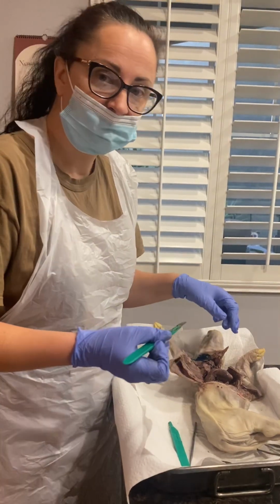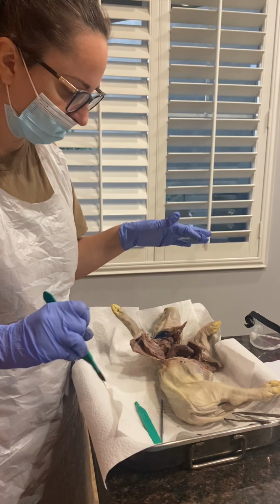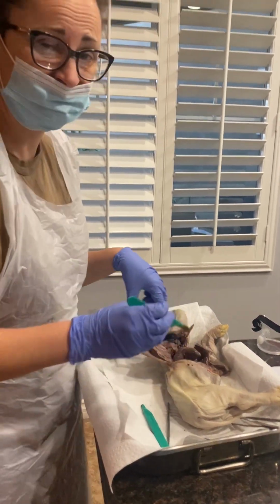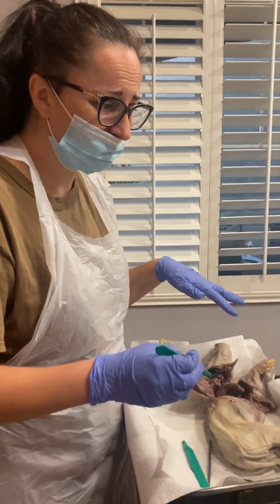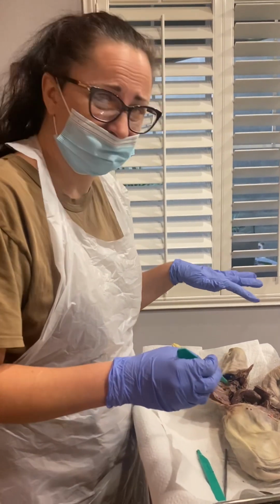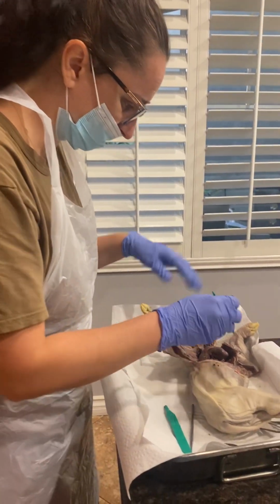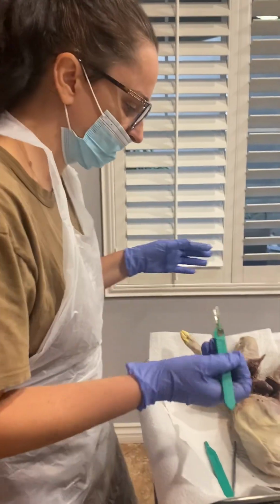Okay. Hi, this is Dorothy, and today we're going to be going over some parts of the pig. I named him Billy, and he's all chopped up. I kind of chopped him a little bit too much 2 weeks ago. I kind of destroyed his thyroid gland, and I can't see it here anymore. I think I was clearing stuff out of the way, and I got it out of the way. That's before we learned about it, so yeah.